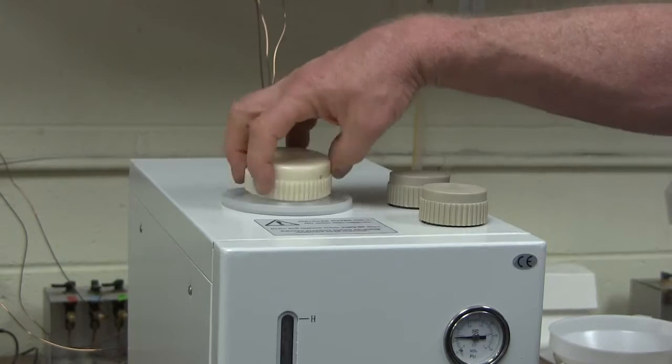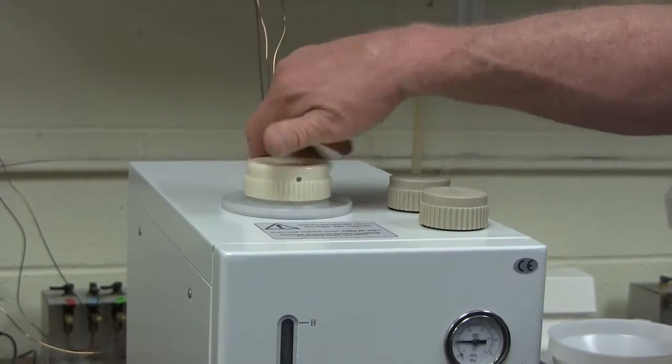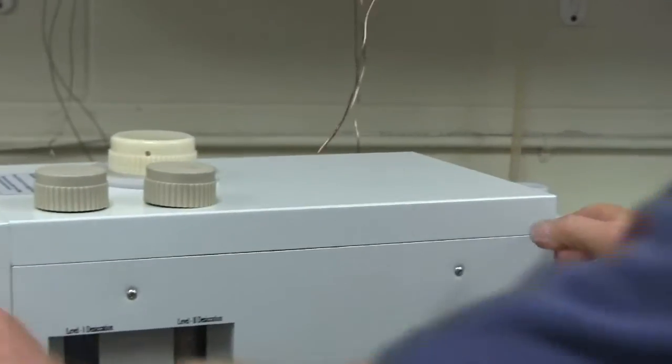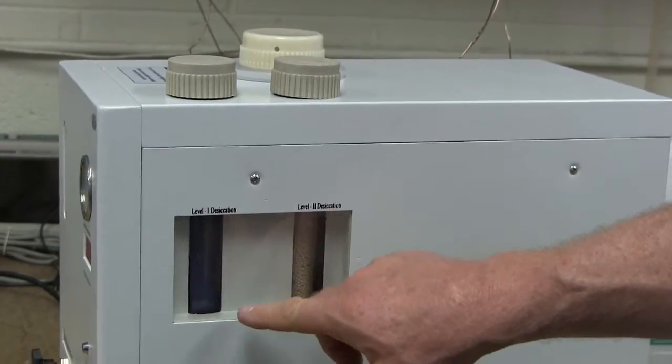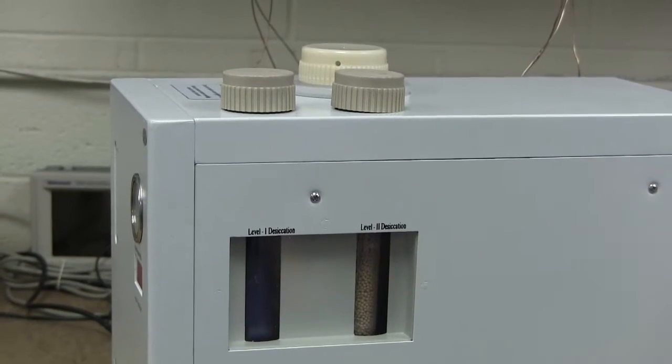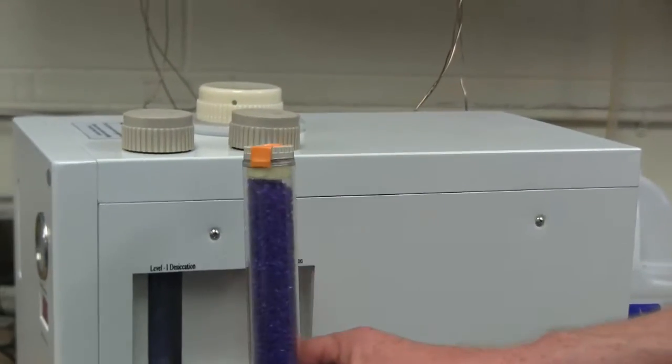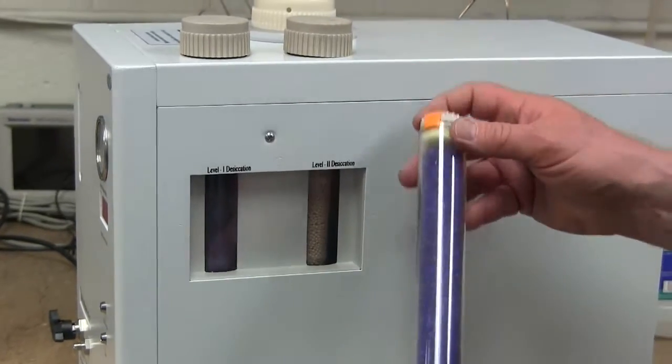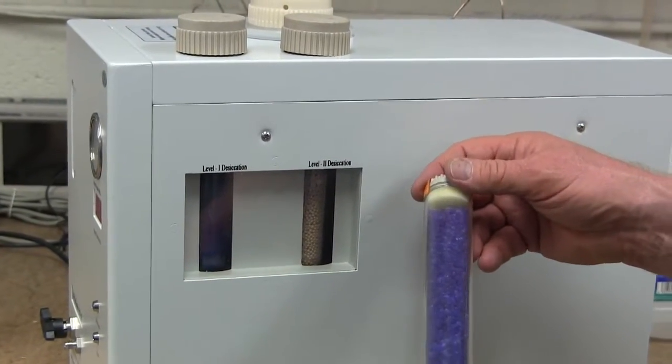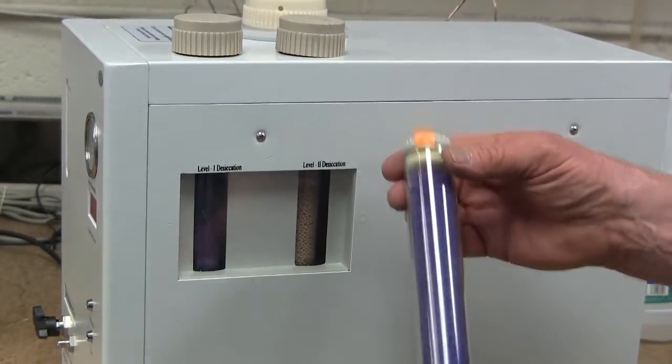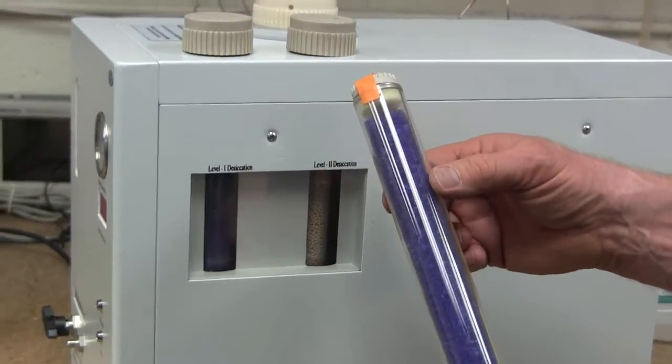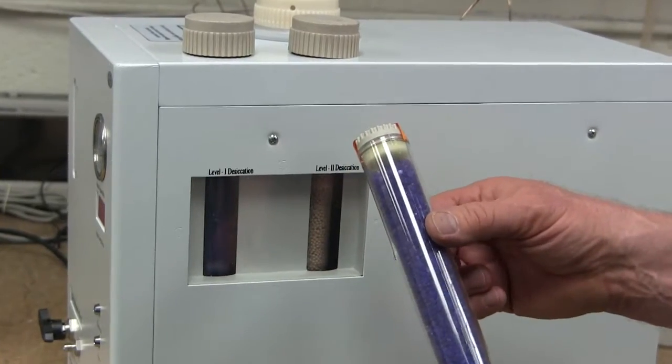So when it makes the hydrogen, the hydrogen has a little bit of water vapor in there. And on the side of the hydrogen generator, there's two hydrogen dryers. There's this first hydrogen dryer, which is filled with something called silica gel. The silica gel is purple when it's dry, and it's pink when it's wet. So when this color turns pink, that's your signal that you need to regenerate the silica gel.